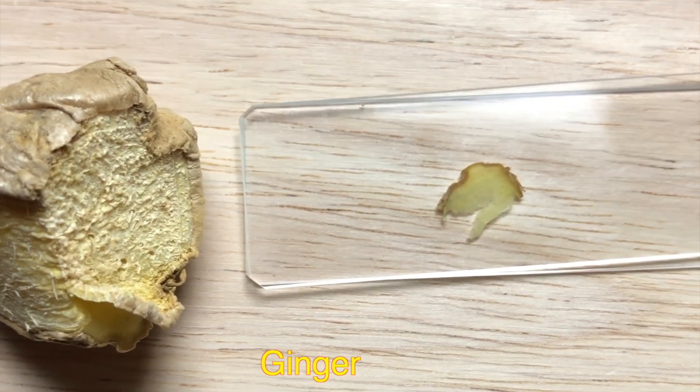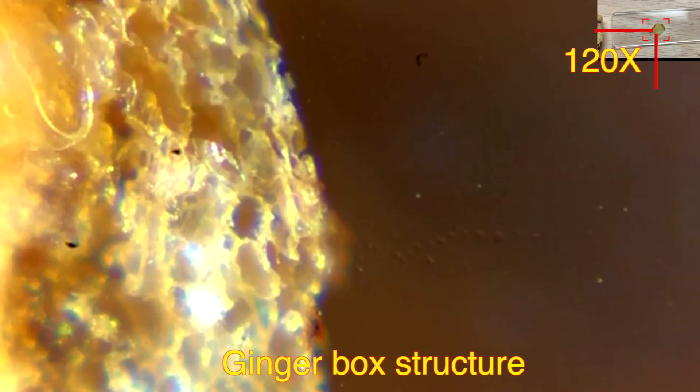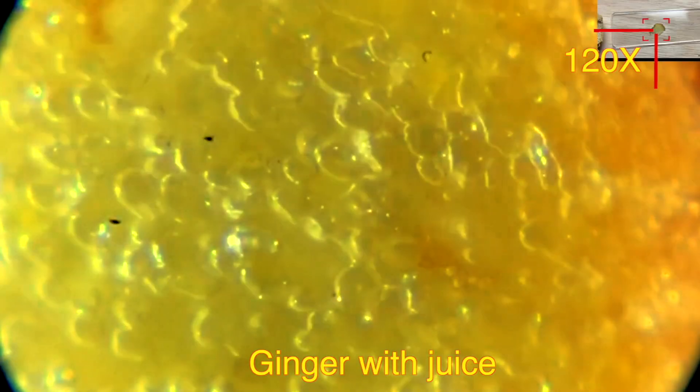Let's look at a ginger slice under the microscope. You can see a fiber sort of structure — they have a box-like arrangement, and I think that holds the ginger juice inside it. You can see some of them right here.